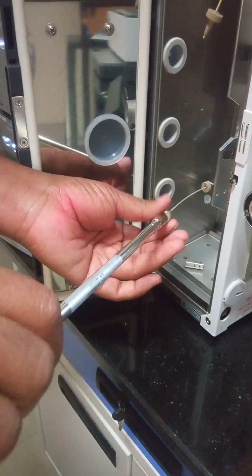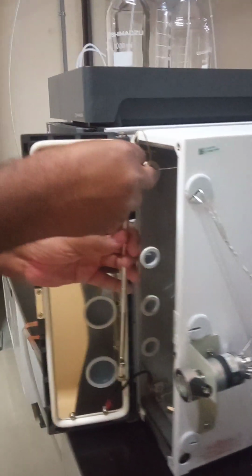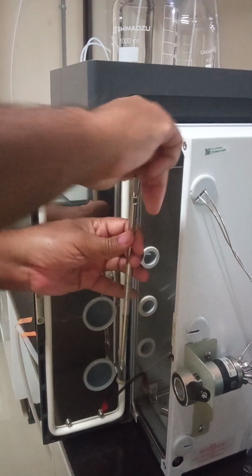Okay, just a little bit tight. Hand tight is sufficient. Then the upper side, just rotate again. Again, rotate it.